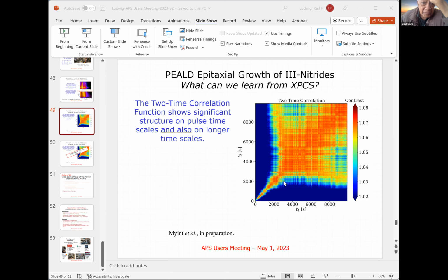But as you can see, the very fine structure you see here is real. I haven't blown this up for you because it's still in data analysis, but the very fine structure is the 60-second cycle, and you can study that 60-second cycle. I just haven't put the plot here, but you're right, there are other blocky structures that we're struggling with.